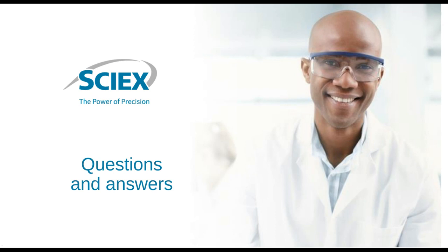Not particularly. What I would say is you want to be cognizant of the ionic strength that's left over in your sample. So in the MedImmune paper, they discussed going to a certain amount of TE, so of the Tris EDTA buffer that they were extracting in, and they found an optimal range, which I can't remember off the top of my head. But I didn't do that. That was something that I could have explored, but really I didn't have all that much material to work with, I'll be honest. So doing a buffer exchange on a minimal amount of material isn't exactly easy.